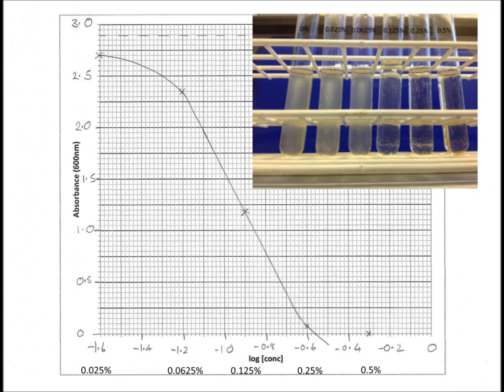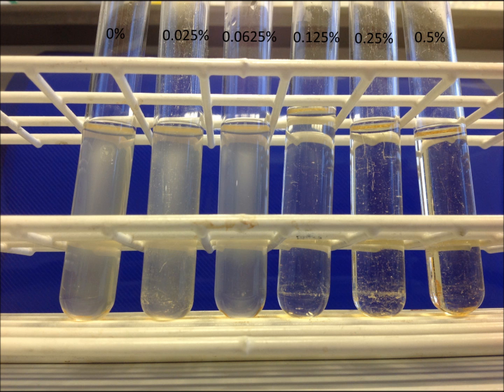So you're asked to think about how you could adapt this experiment to give you not the minimum bacteriostatic concentration but the minimum bactericidal concentration. We know that 0.5% Chloros is bacteriostatic but we don't know whether it's bactericidal. The adaptation to the experiment that you need to do is very straightforward.